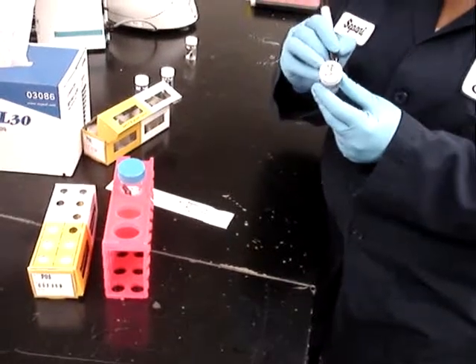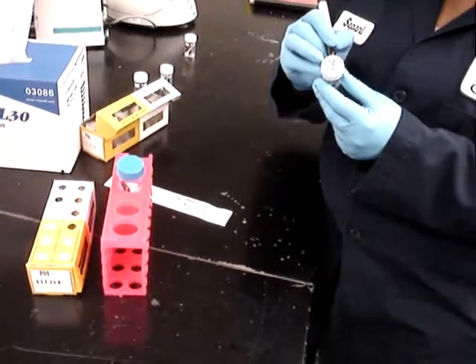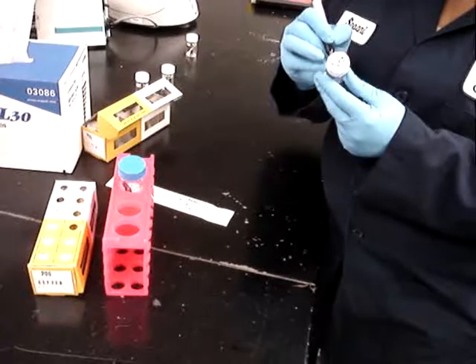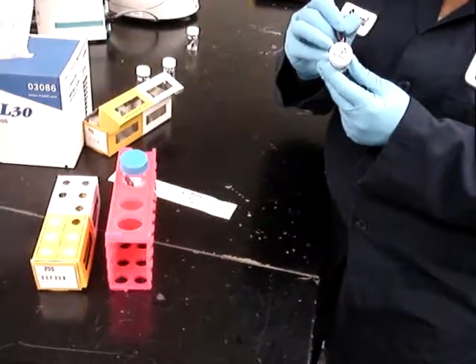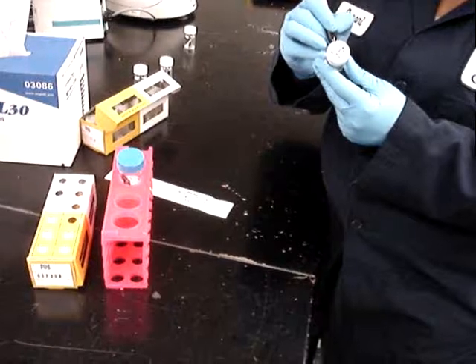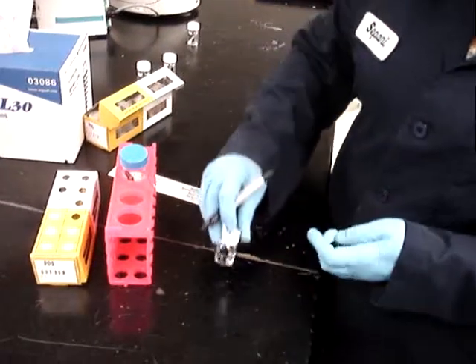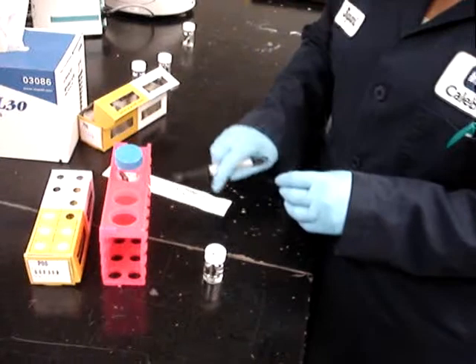First, a vial of preservative is labeled with the sample information and the date, and then we're going to collect biofilm from a corrosion coupon.